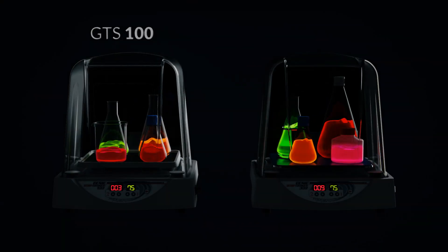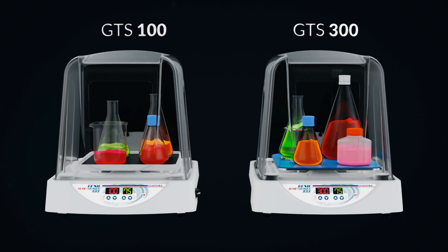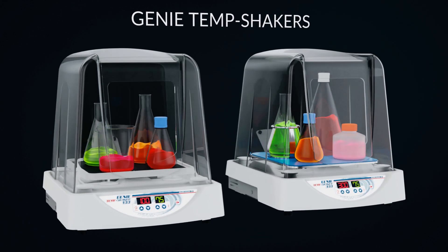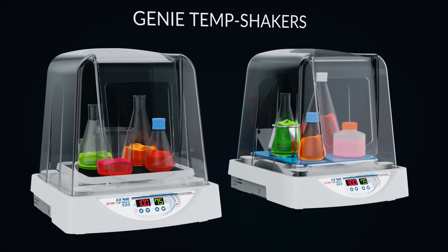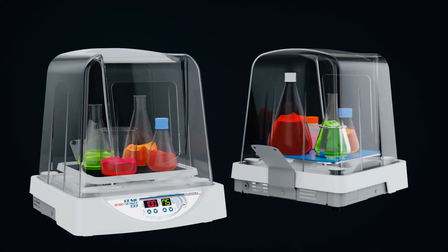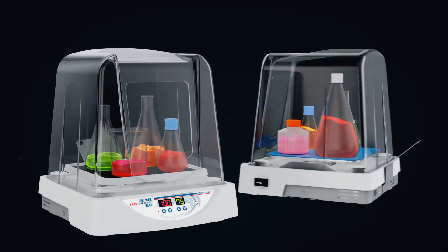Introducing the GTS 100 and GTS 300 Orbital Temperature Shakers. Another thoughtful genie design from Scientific Industries. Unmatched flexibility and ease of use in one lightweight design.